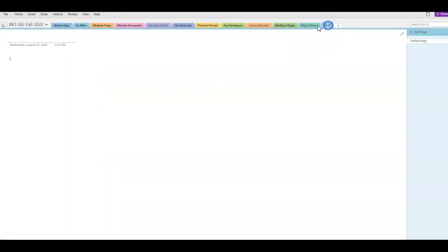The first thing I would do is call this a particular page, call it gel electrophoresis, something like that. Helps if I spell it right. And so from there, the first thing I do is put on supplies or materials. You could say it either one.